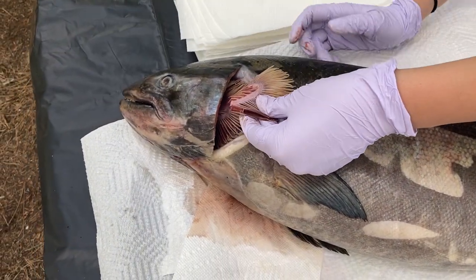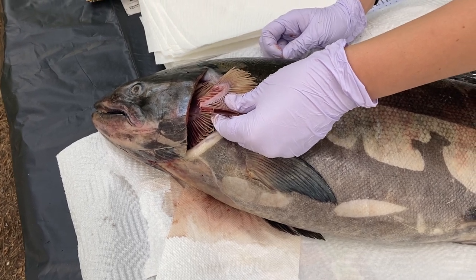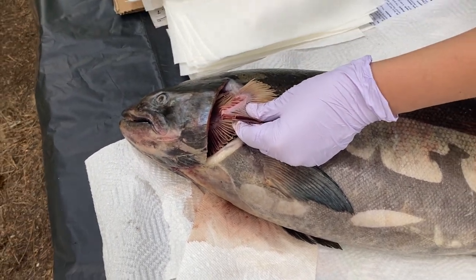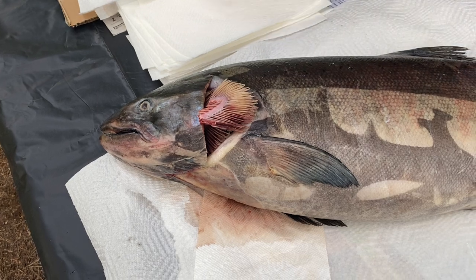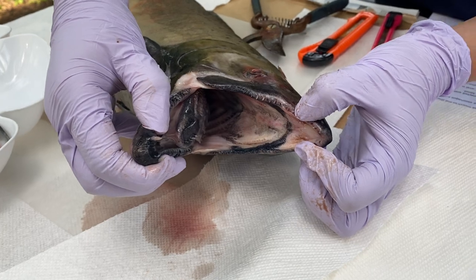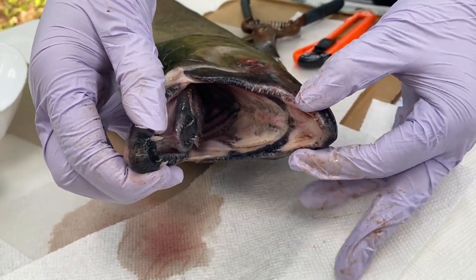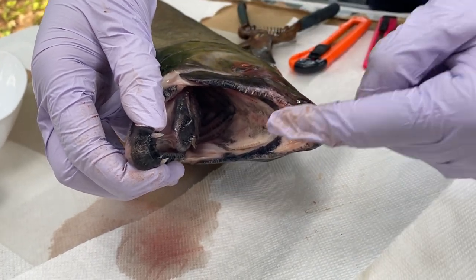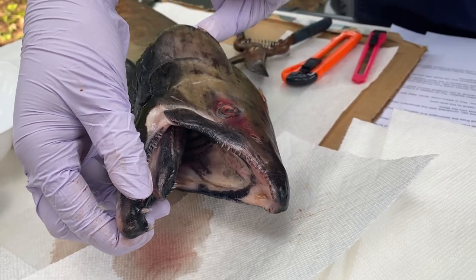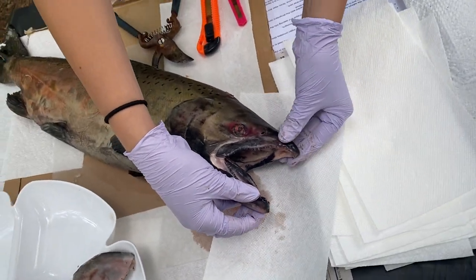And so what happens is, you can imagine when you're swimming in the water and your mouth has to be open for breathing, for life in general, for drinking and just swimming and eating. And so sometimes when you ingest water, there's going to be some things that you can eat alongside of it. If we look in the mouth of this one, you'll probably see it a little bit better. We can see that there's all those gill rakes on the inside. So those gill rakes decide what is going to be food and go down to the esophagus, and what is going to be water and have to leave through the gill or the operculum here. And so they're going to take the oxygen out of the water, and it's going to exit out through those gills.